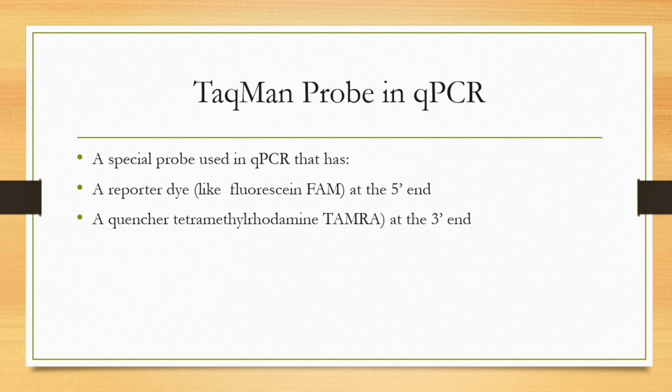TaqMan probe in real-time PCR. It is a special probe used in real-time PCR that has a reporter dye and a quencher dye at the 5' and 3' end, respectively.